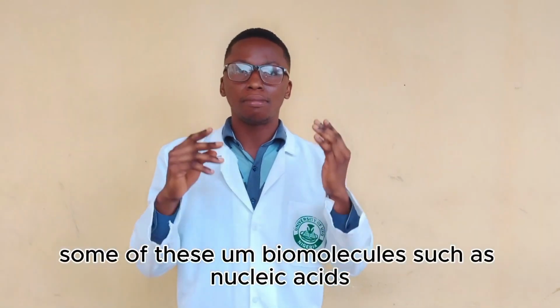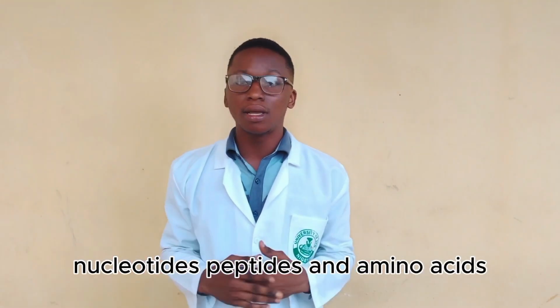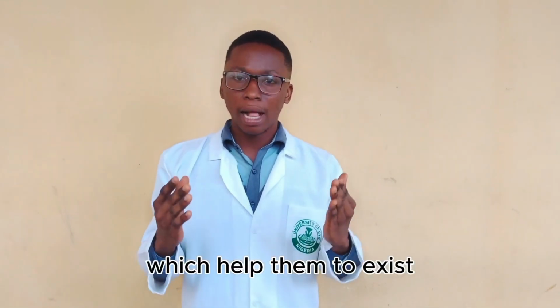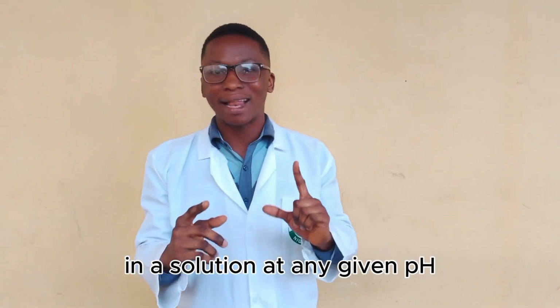Some of these biomolecules, such as nucleic acids, nucleotides, peptides, and amino acids, possess an ionizable group which helps them to exist as electrically charged species in a solution at any given pH.